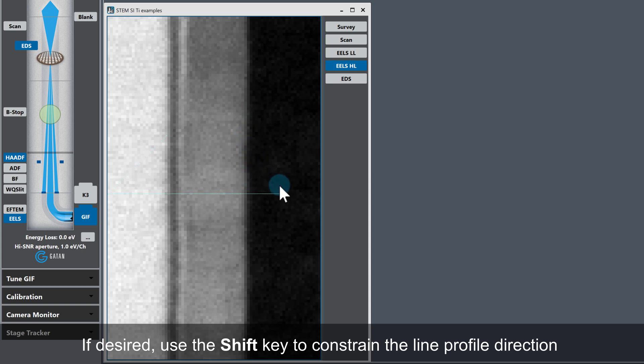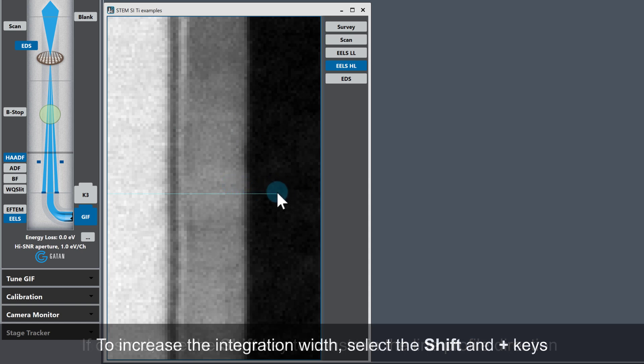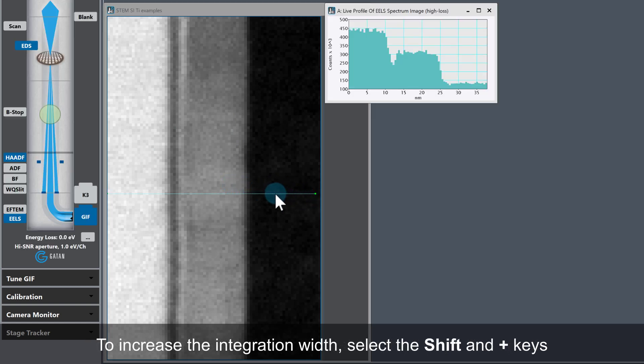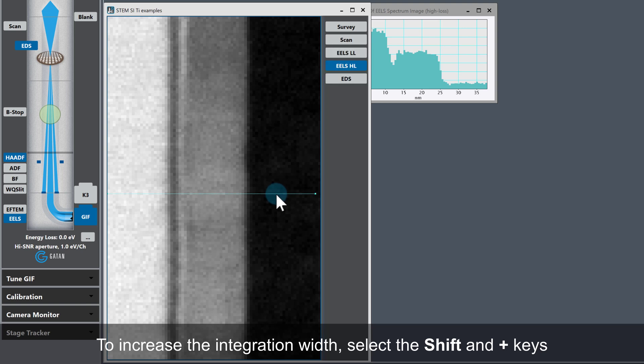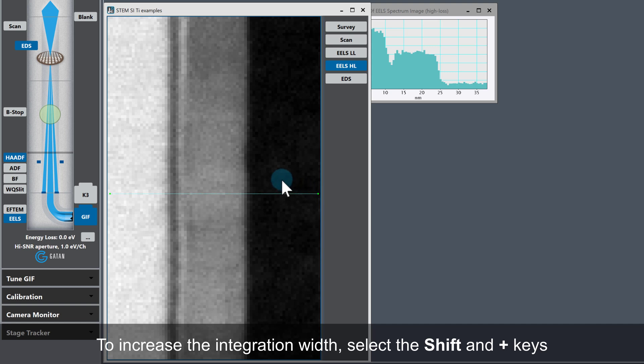Next, increase the integration width of the profile you've just drawn. Select line profile, ensure you have the green handles on the end of the profile region, then hold the Shift key and use the plus key to increase the integration width.